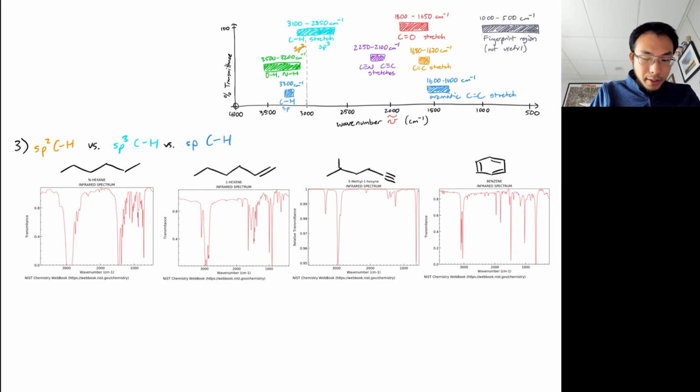So what we're trying to see here is where these stretching frequencies are showing up. I know the font's a little small, but this number here is 3000. What you're seeing is all the CH bonds piling up. All their different vibrations and stretchings are showing up here, right? So I'm just going to draw a couple of these CH bonds in here. Those are all showing up in this less than 3000 region. That's this big peak right here.